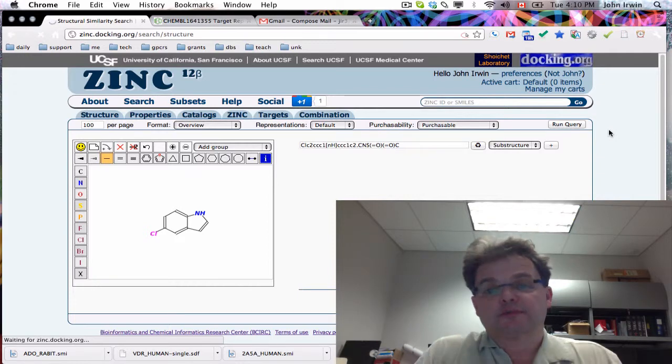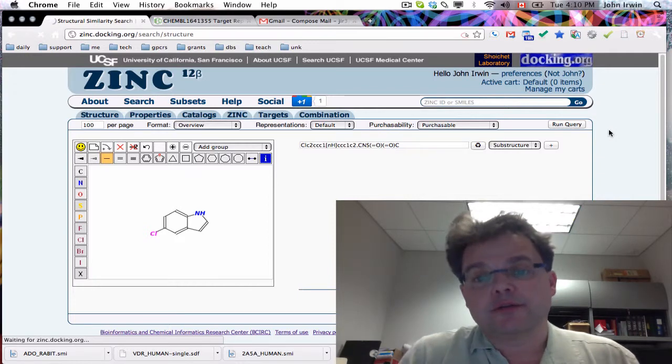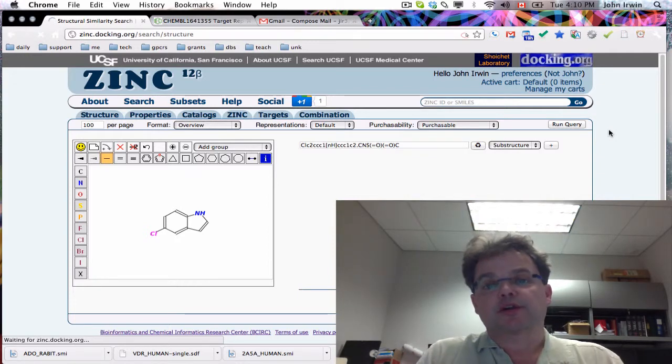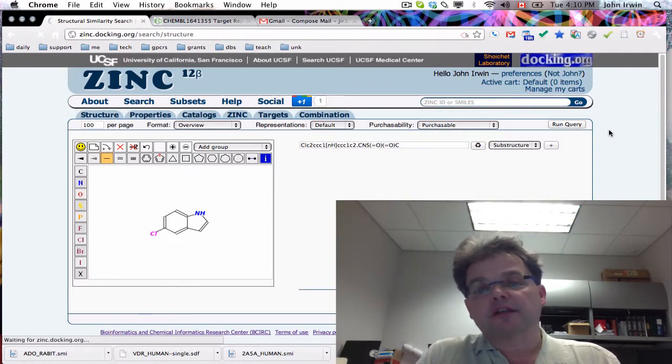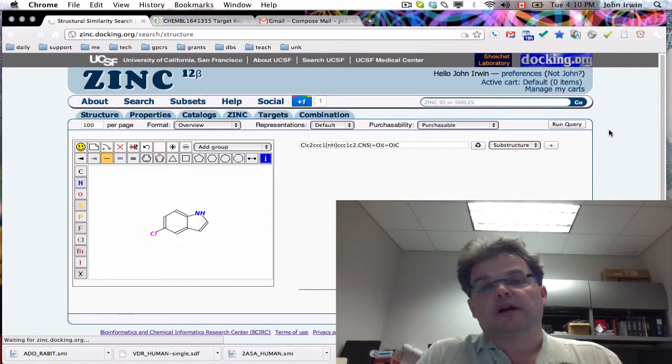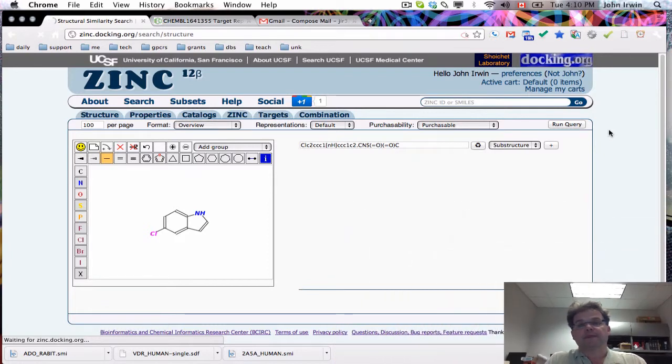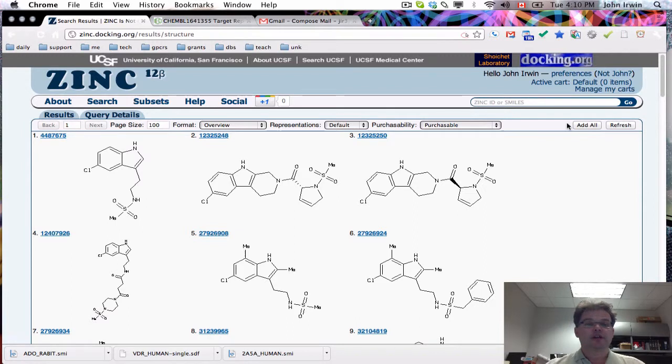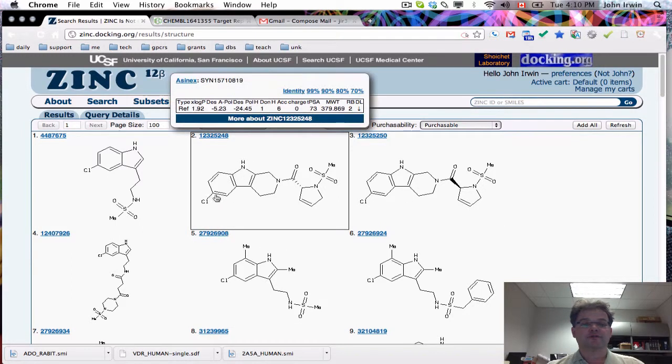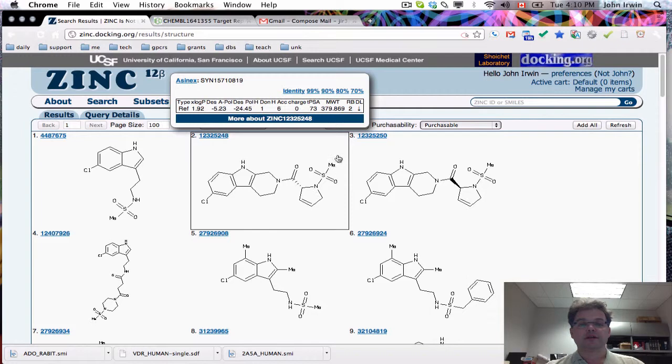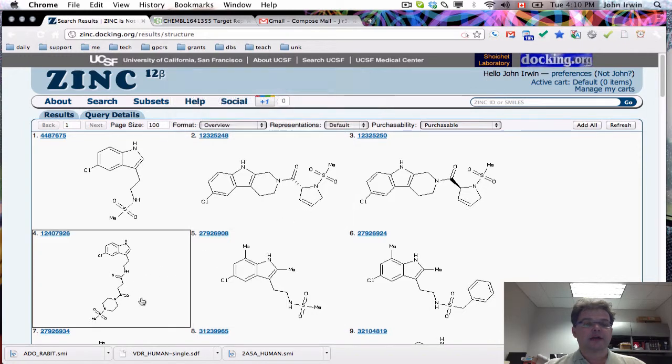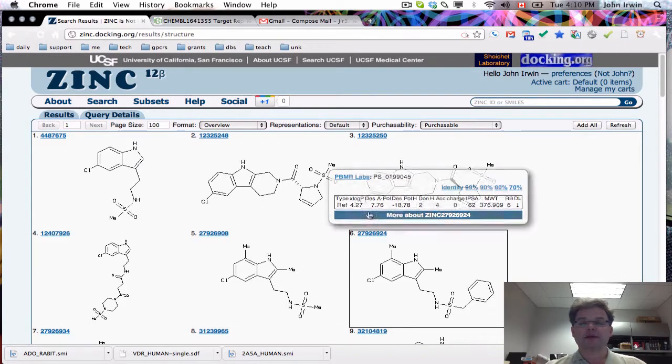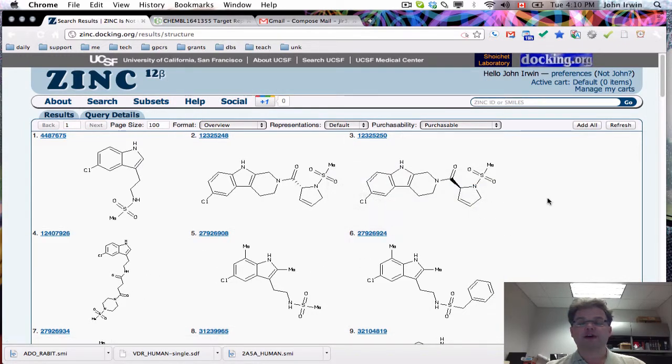This gives me a chance to remind you that when you search with substructures, it can take a little while to do the query. Searching by similarity is usually faster. Let's just check that we're right. There's the 4-chloro indole and there's the dimethyl sulfonamide. It's got a nitrogen at the other end, not completely happy about that, but it's pretty close, and maybe we have to refine the search a little bit.